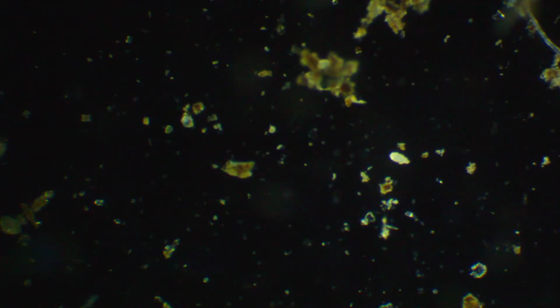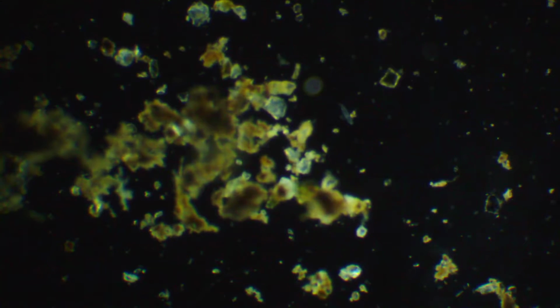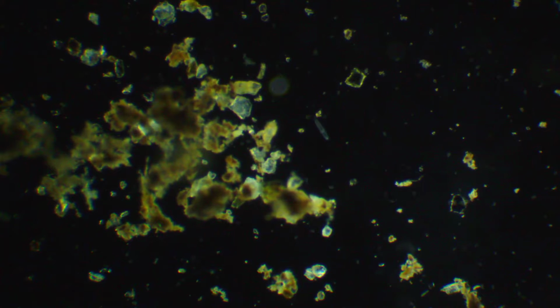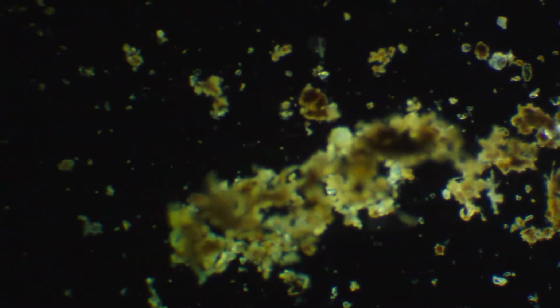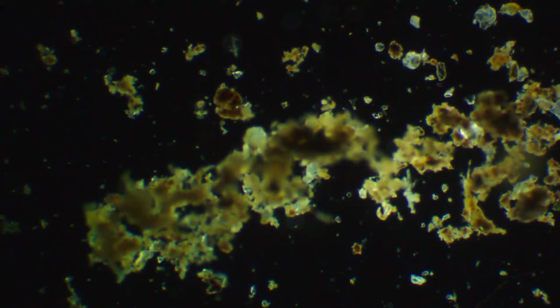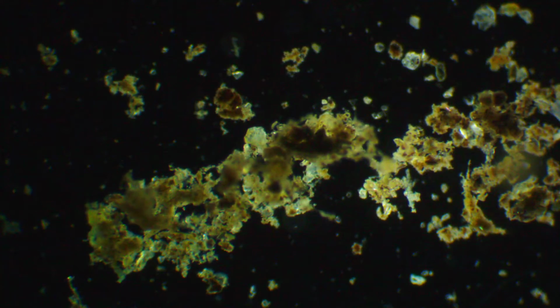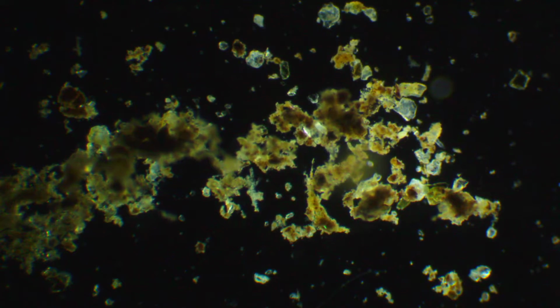I usually see a lot more worms. I haven't seen any of the little quick worms anymore. I only see these little guys here, these little inchwormy guys. They kind of move around on the bottom of the glass inchworm style. See a lot of those. Here, let me look in here real quick. I always forget to look in there. Another worm thing.